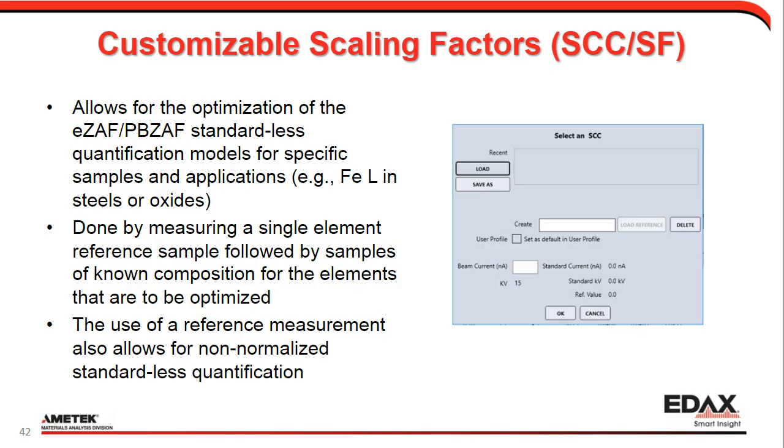When our model does the first principle calculation of electron-excited photons for iron, which is an important parameter in the quantification model, we just do the average. This is what we think is the best for most applications, not necessarily the best for minerals or steels.